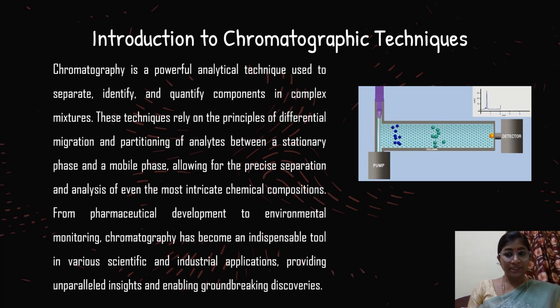Introduction to chromatographic techniques. Chromatography is a powerful analytical technique used to separate, identify, and quantify components in complex mixtures. These techniques rely on the principles of differential migration and partitioning of analytes between a stationary phase and a mobile phase, allowing for the precise separation and analysis of even the most intricate chemical compositions.